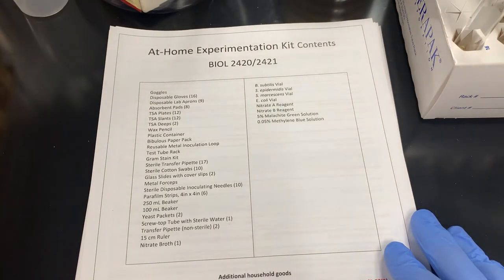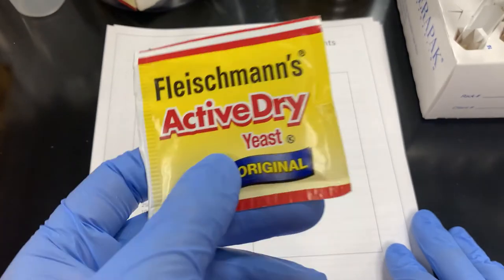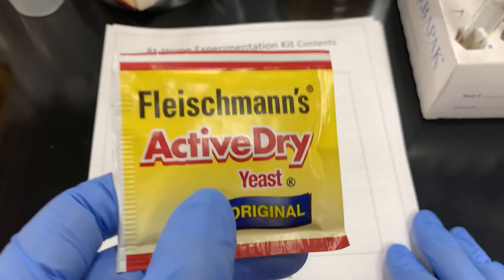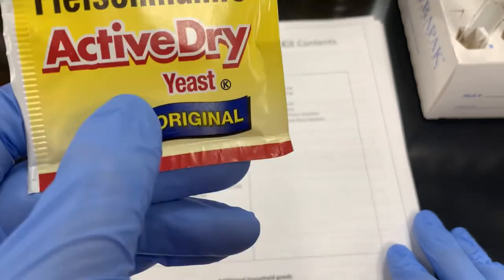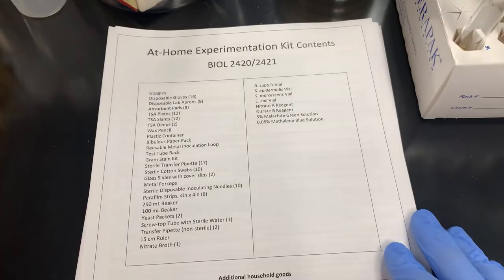You get two yeast packets. We know yeast can be hard to find, so we special ordered it for you. You get two of these. You're going to use them at different lab times. Do not use both for one lab. You need them for two different labs during different weeks. Do not open both at once. You only need one. There is more than enough for each lab experiment, okay?